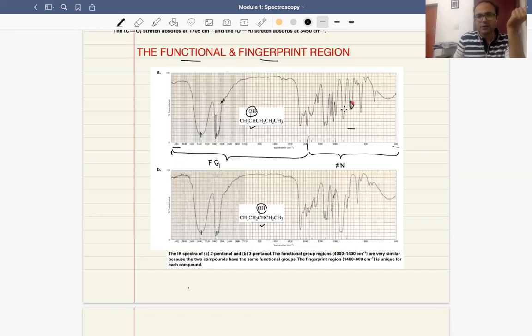However, when you come to this particular peak, it is kind of a broader peak with a higher intensity. And these peaks look like medium-intensity peaks. So in the IR spectrum, usually we see peaks with varying intensity.